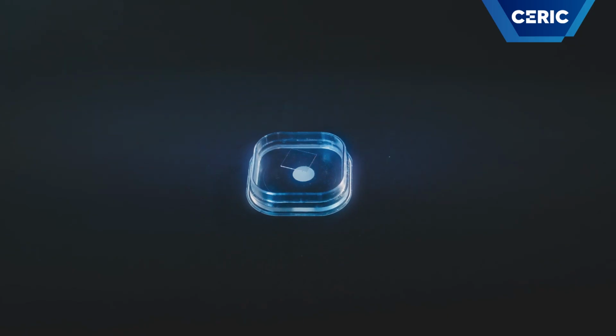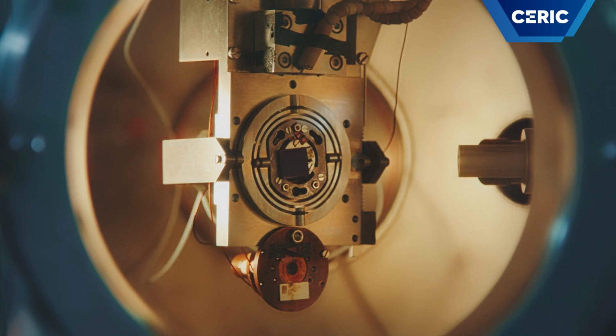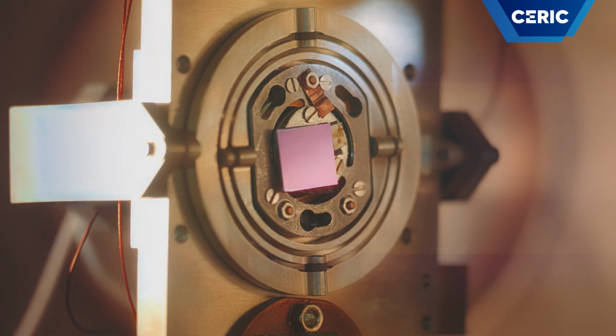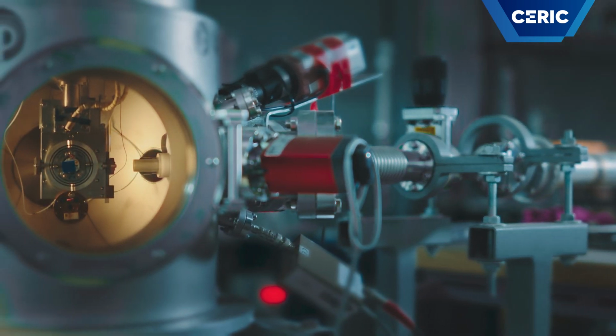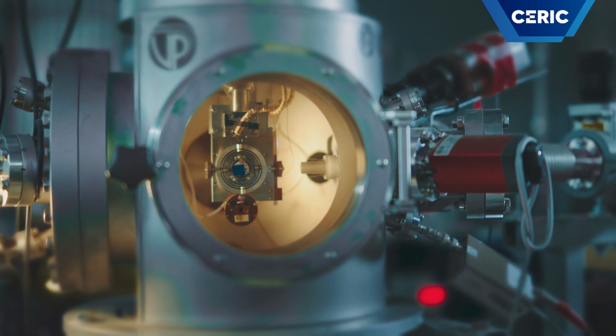RBS channeling is suitable for investigation of single crystal samples with flat surfaces. Sample sizes can range from a few millimeters up to about 1 square centimeter, while their thicknesses could be up to several millimeters. Samples are investigated in the vacuum chamber by exposure to proton or helium ion beams of energies between 1 and several mega electron volts.